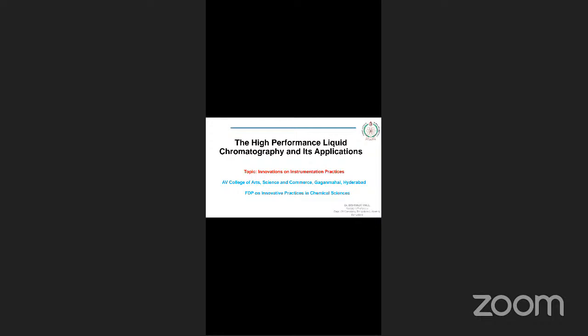So good morning, all. Thank you, sir, for inviting me to give a talk on innovation in instrumentation practices. I'm going to talk today about one of the important innovations that has happened in chemical sciences on the aspects of separation science. There are a lot of things going on in the context of HPLC, which is high performance liquid chromatography, and the applications that are coming out of it.